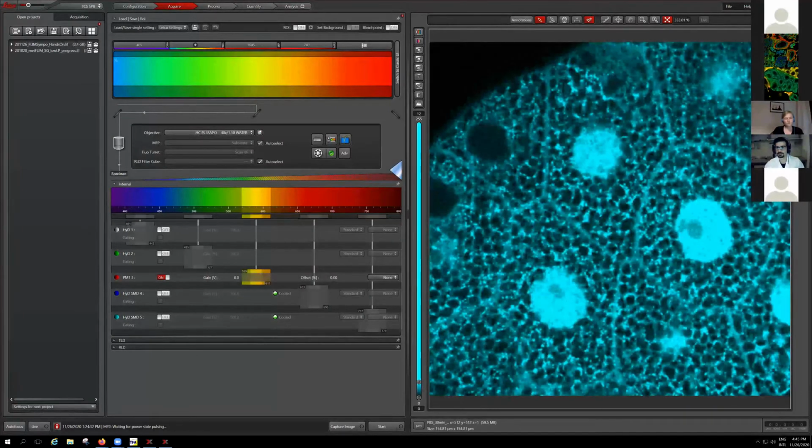But for NADH, not a good idea, if it is environmental changes. You have to use live cells for metabolism measurements or the NADH signal. We did fix the cells and tested that. When you fix it, it maintains the state at the time of fixation. Then you can see some lifetime value, but it is decreased. It's not 2.4 nanoseconds, it is about 1.6 or 1.8. Then after the second time you excite, there is no NADH molecule. Just one excitation and it goes away in the fixed cells for NADH measurements.